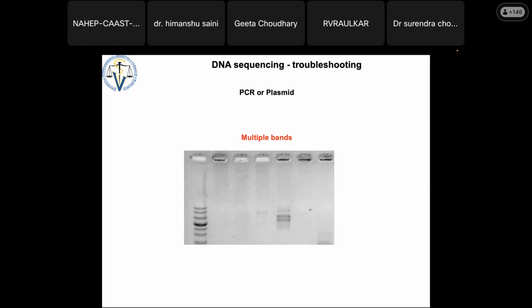You have to use the long needle, not small like this. So the idea is, if this is the gel on the transilluminator, and this is a yellow band, I will punch it. Do you remember the Ouchterlony gel diffusion test puncher? It's the same. So I will punch it on that band.